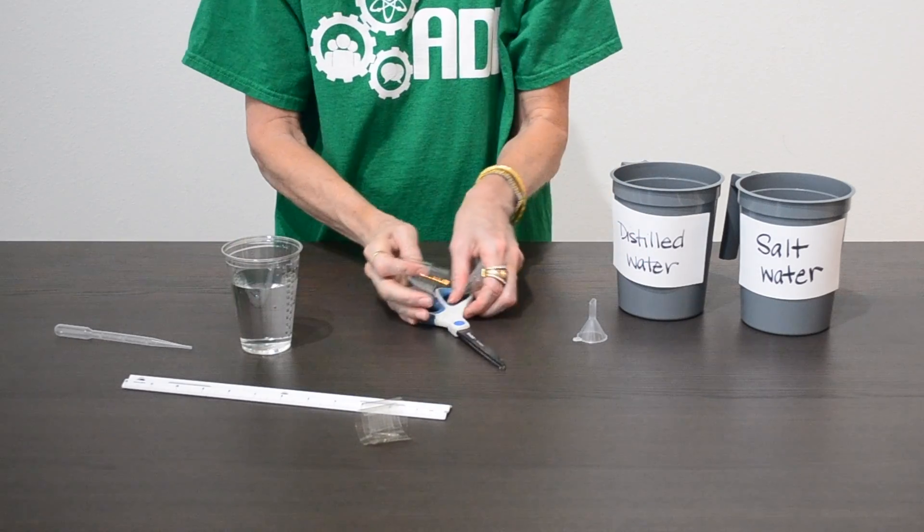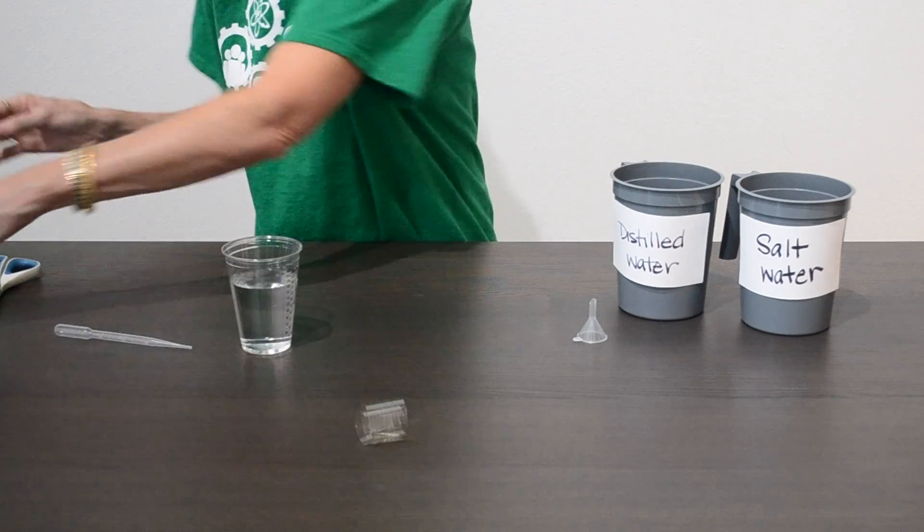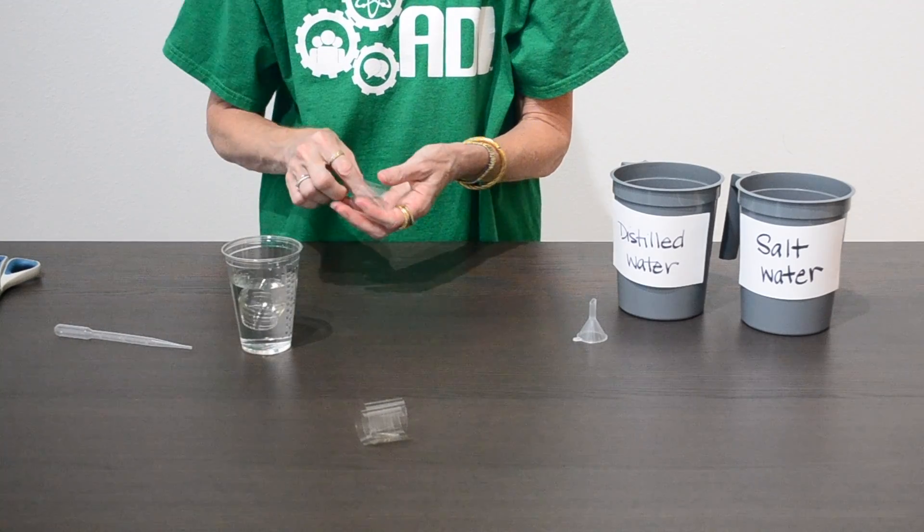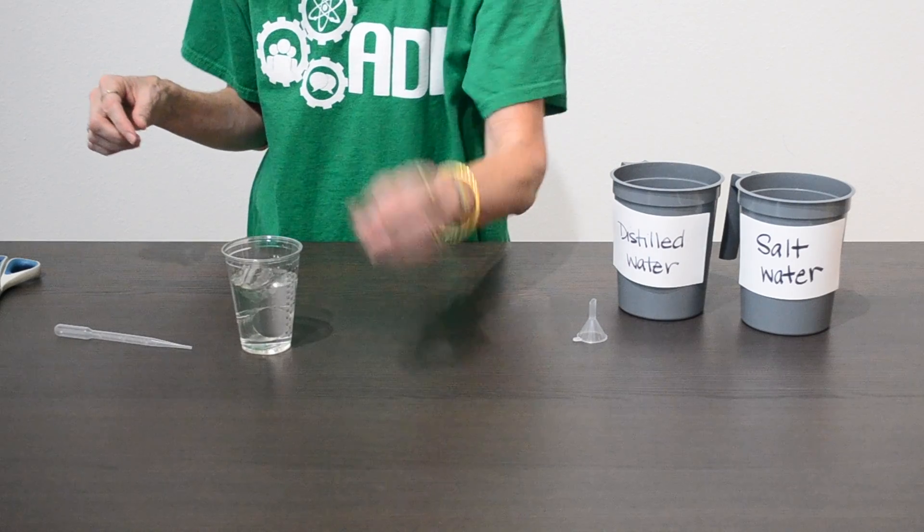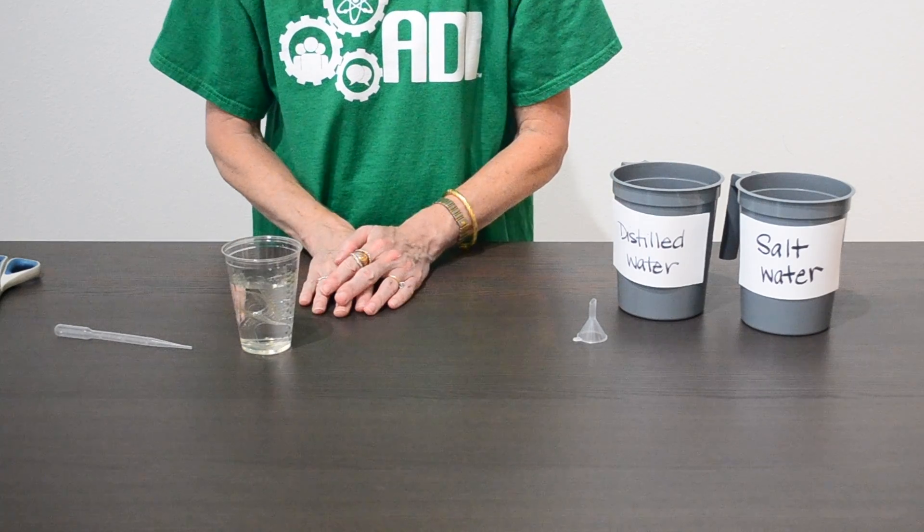Once you've got those three pieces, to be able to work with the dialysis tubing we need to soak it in some distilled water. So we're going to drop it in distilled water, and you're going to leave it there for about ten minutes.